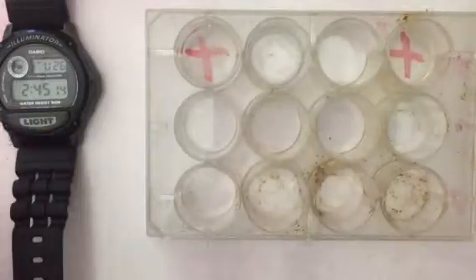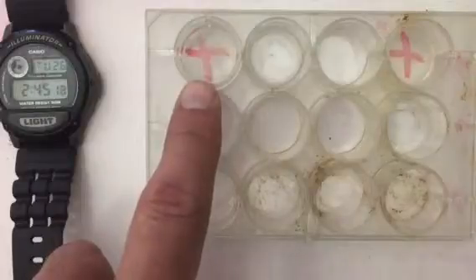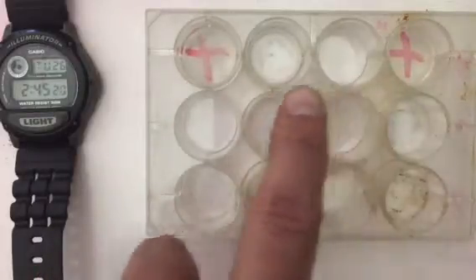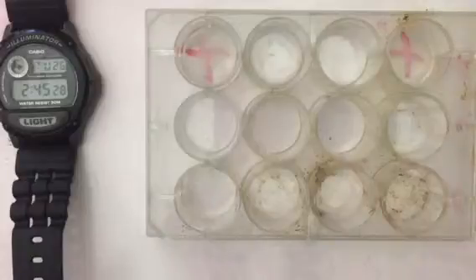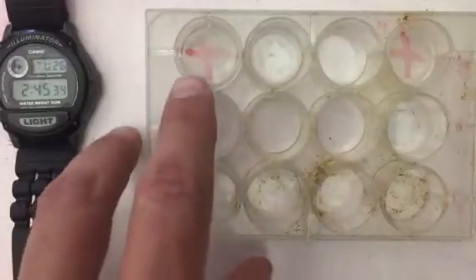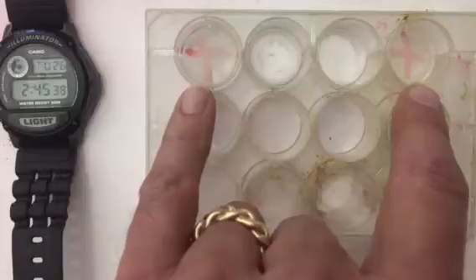I can definitely see that this one is starting to react, maybe a little more than this one, and we can use this as a comparison. It's hard to tell when we're being qualitative, but with this one, we can say, okay, this is definitely a full reaction, and we can use these as a comparison.